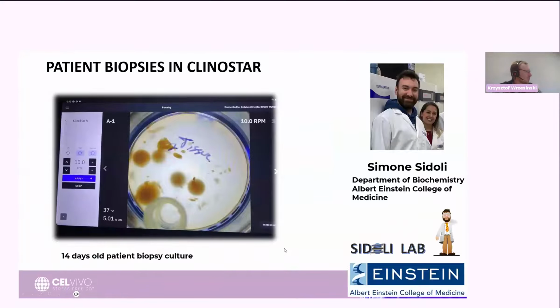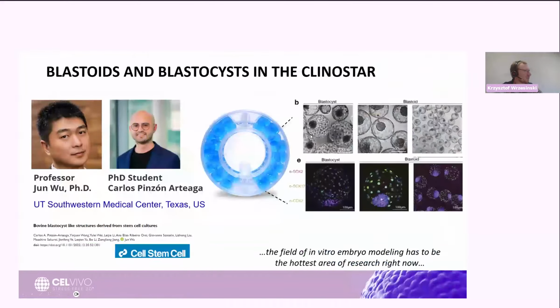I also would like to show that it is possible to culture or keep alive patient biopsies in our system, and that is the ongoing study from Simone Sidoli's group from Albert Einstein College of Medicine in New York. They are using a ClinoStar 2 system, and they have very nice results. I also hope that soon we will see some more out of this study.